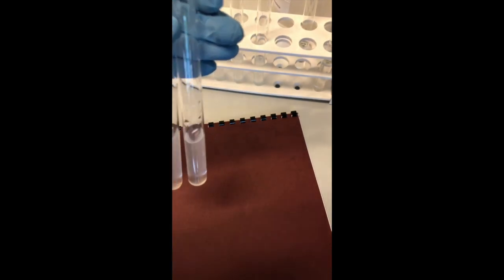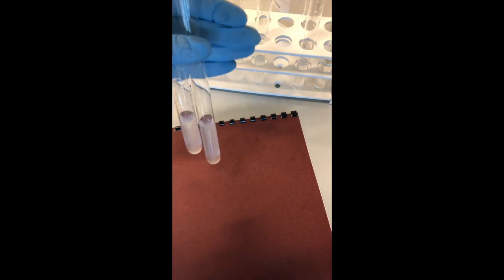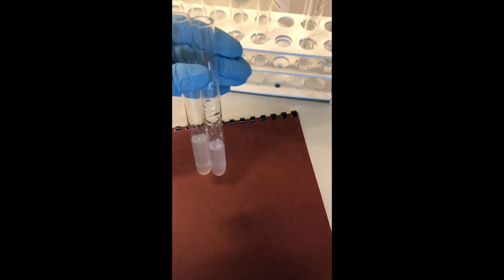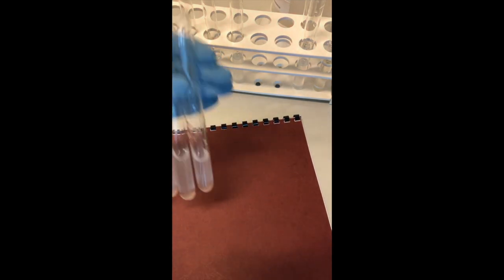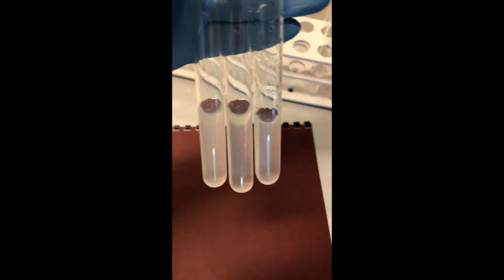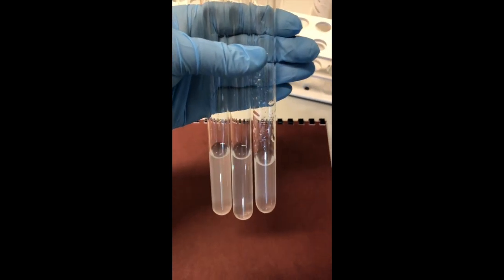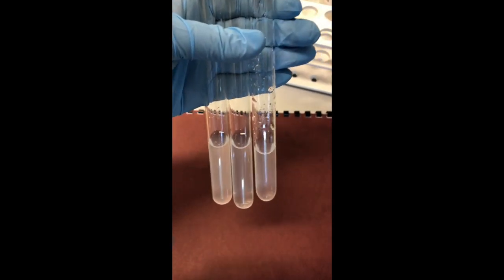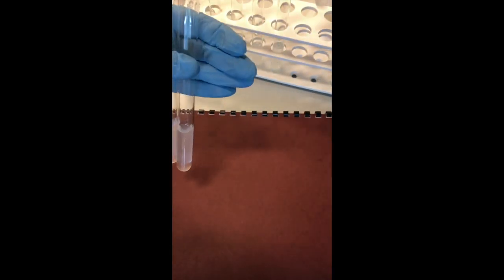Just to compare, we will compare it with the higher concentration. So we take this one on the right, this one on the left, and we compare. It's not well seen, oh, maybe here. A bit better. So we see that this one is much more milky, and we do it again to see the difference.